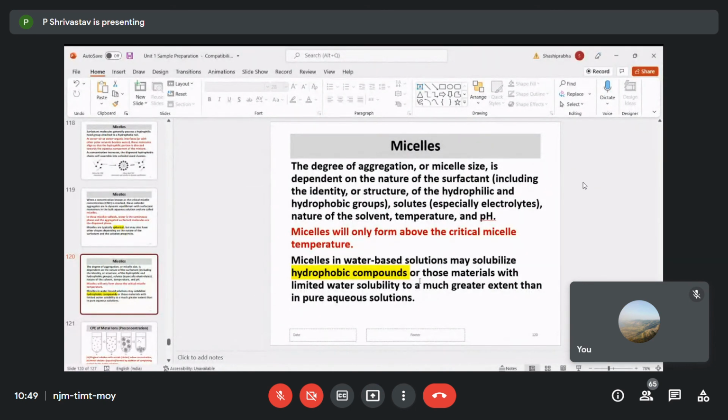Micelles don't form at any concentration. They are formed at a very typical concentration. This is entirely a different chemistry of surfactants. But when you heat it, it forms a different phase. This is the beauty of this technique, that when you heat your sample, heating doesn't mean you need to go up to 100 degrees centigrade. You can keep it at 50 degrees centigrade for about 15-20 minutes and it will form a distinct phase. And once that distinct phase is formed, it will have your analyte of interest. And that is how it works.